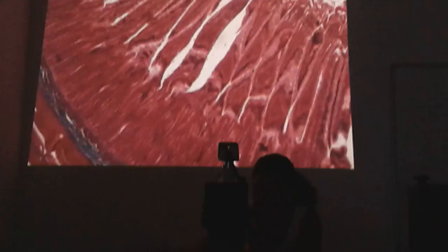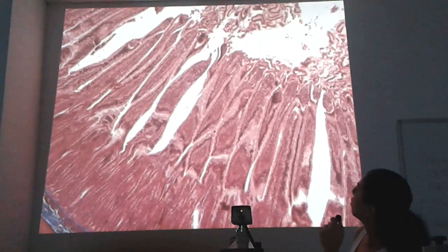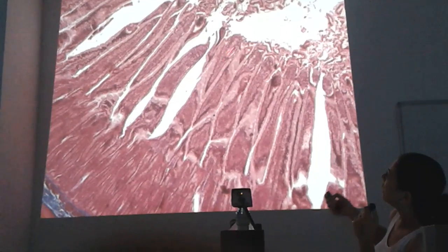In this slide, MA1209E, you will have 3 different tissues. And for simple columnar epithelium, all you have to look at is the small intestine. It may be difficult to distinguish, but we will help you. It's the darkest organ and the biggest organ on your slide. I'm going to show you how it looks. So this is the lowest magnification. This is an example of the small intestine.